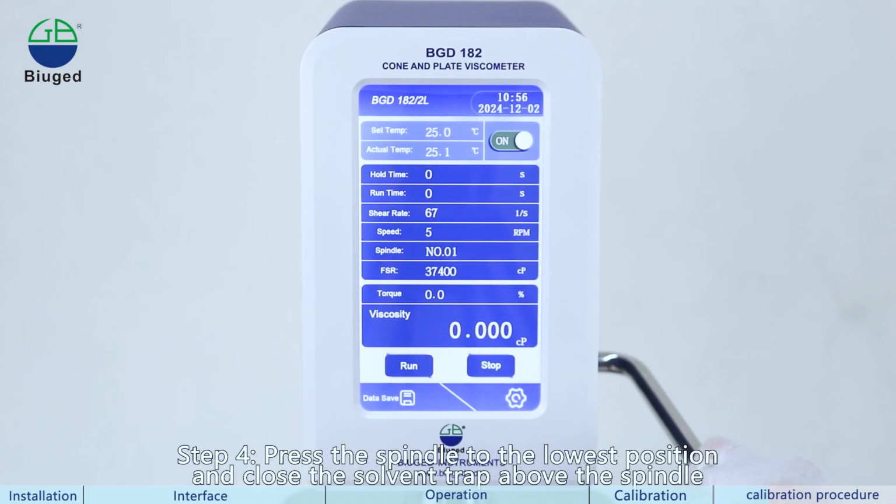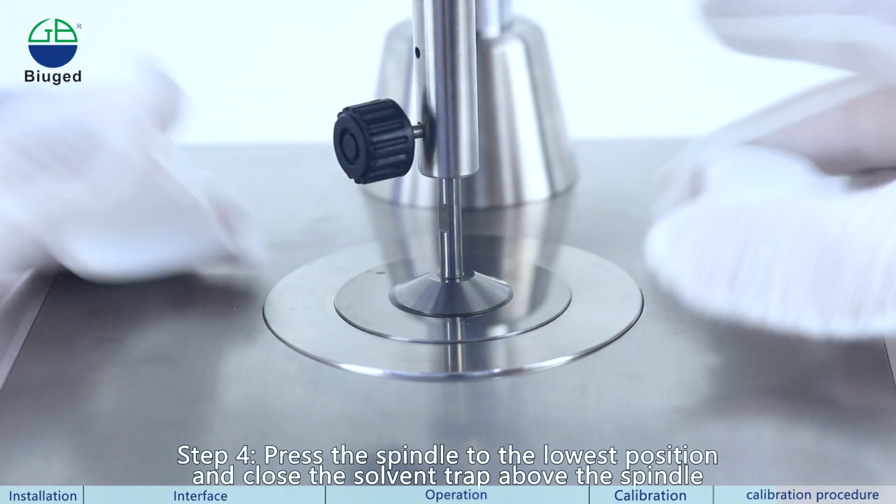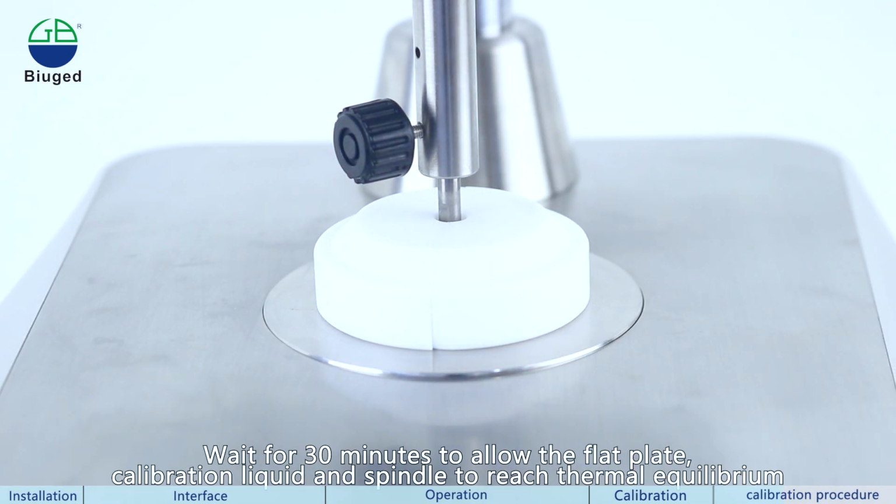Step 3. Lift the cone plate viscometer and drop the test sample onto the center of the flat plate. Step 4. Press the spindle to the lowest position and close the solvent trap above the spindle. Wait for 30 minutes to allow the flat plate, calibration liquid and spindle to reach thermal equilibrium.